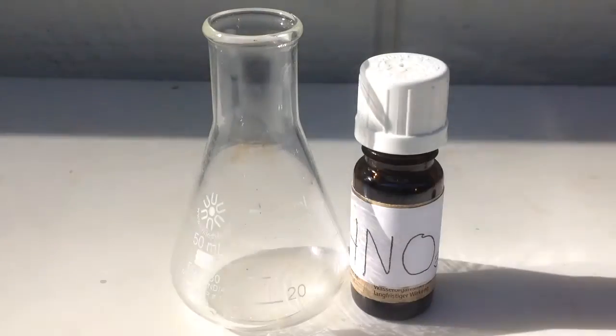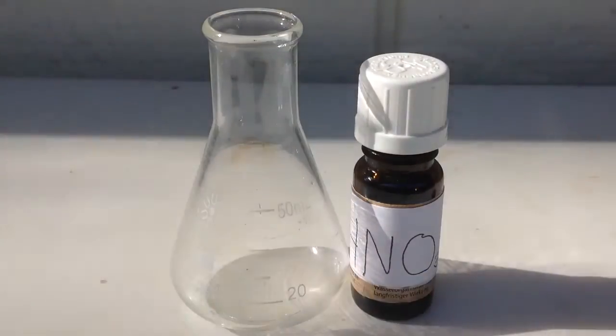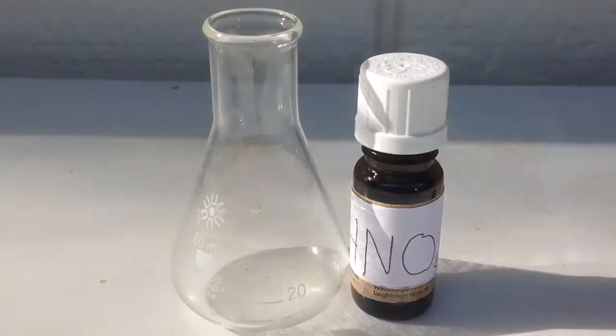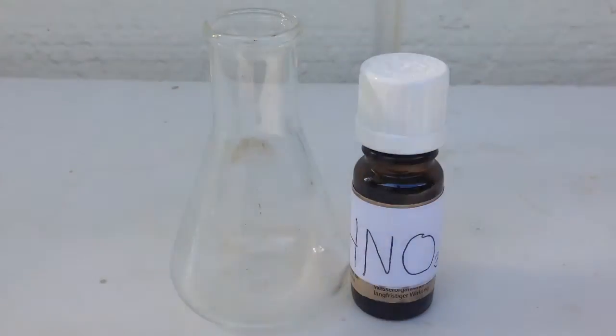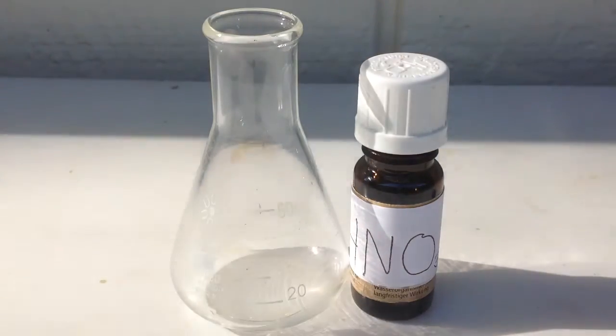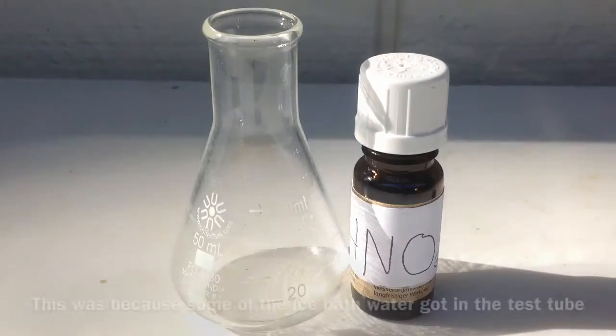The concentration of your nitric acid will vary depending on how long you let the nitrogen dioxide bubble into the hydrogen peroxide or how much hydrogen peroxide you use. Anyway, I think we got about 35 milliliters.